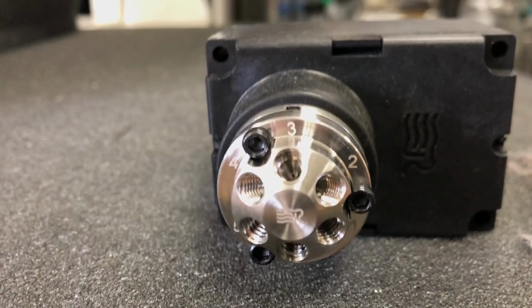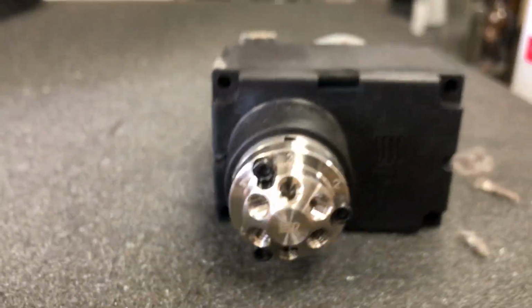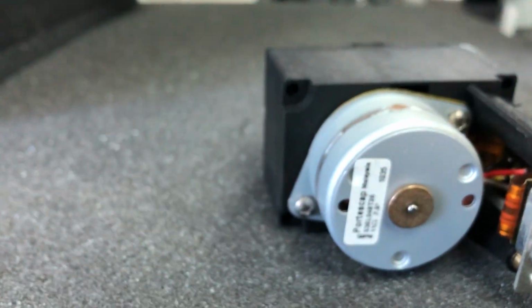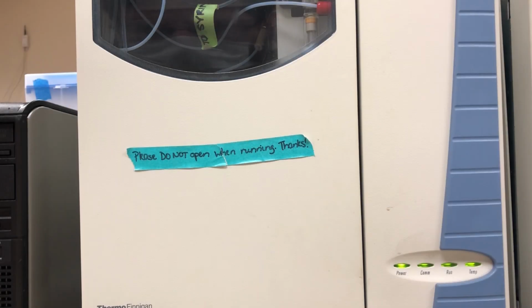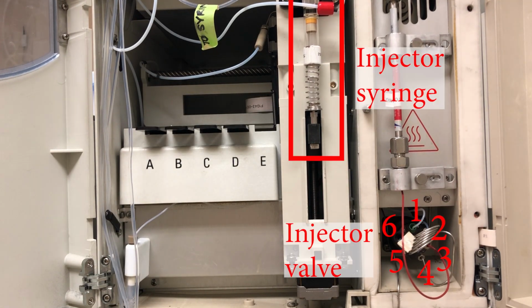Now I have run an instrument with a manual valve, but that's actually not very common. What's more common is this guy. You see the 6 positions here, but it's got a motor on the back, with some connectors so that the computer can switch the valve for you. Okay, so let's take a look at the auto sampler and that valve system here.